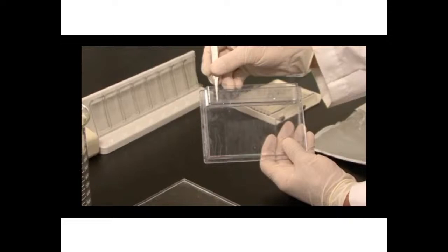For Criterion gels, I usually cut the plug into 4 slices to match the size of the well. In this case, I need 1. With forceps, take one of the slices, place it on the back of the gel cassette over the reference well, and gently push the plug into the reference well.